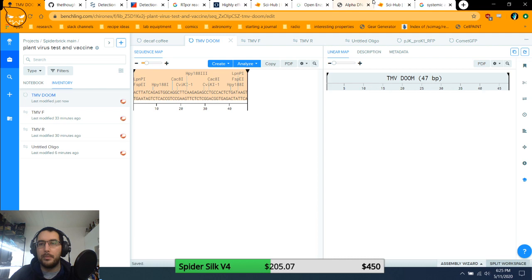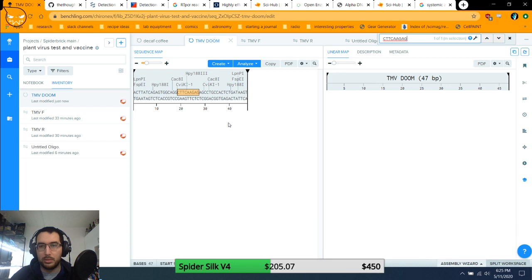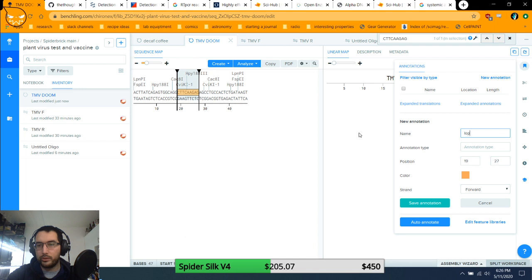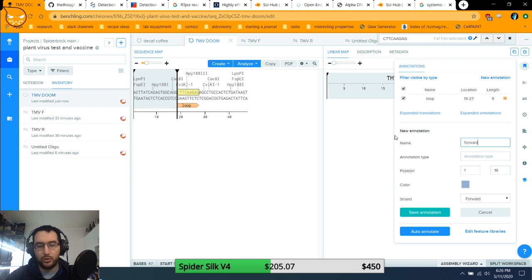I'm going to grab this part. Actually, you know what? I'm going to do this the other way. I'm going to grab the middle bit. I'll explain what I'm doing in just a second. I'm just trying to get this done really quick. Come on, just deselect. Okay, so I'm going to grab this. We're going to label this. We call this loop. Save. There we go. We're going to create annotation. We're going to go forward target.